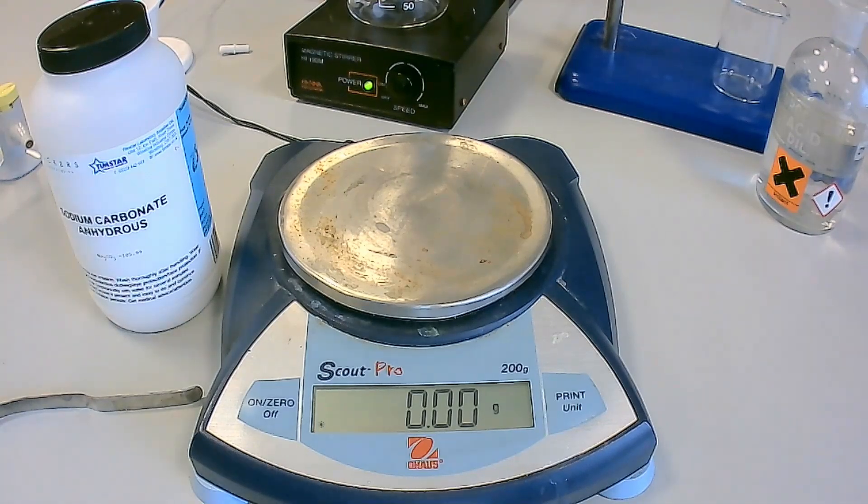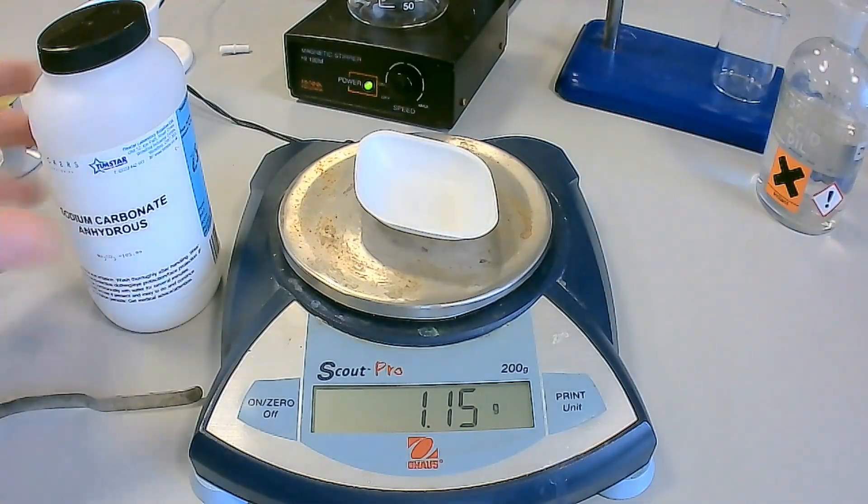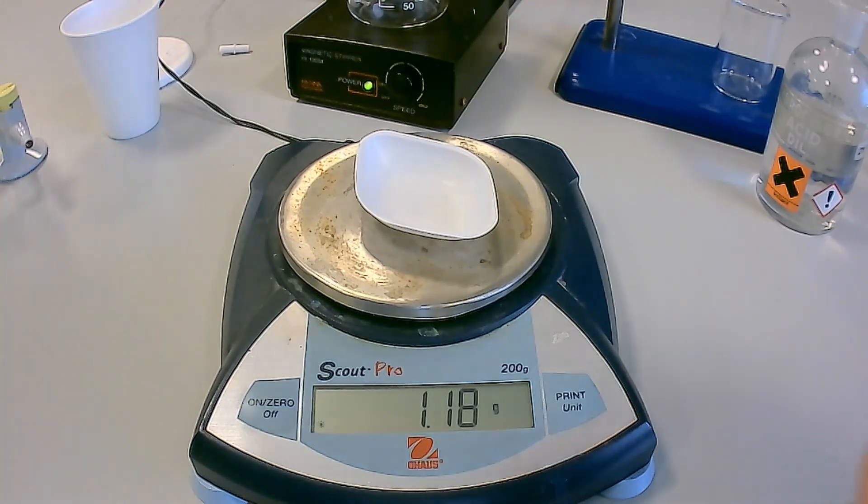In this experiment, we will be determining the enthalpy of decomposition of sodium hydrogen carbonate by determining the enthalpy of reaction for sodium carbonate and sodium hydrogen carbonate with hydrochloric acid.